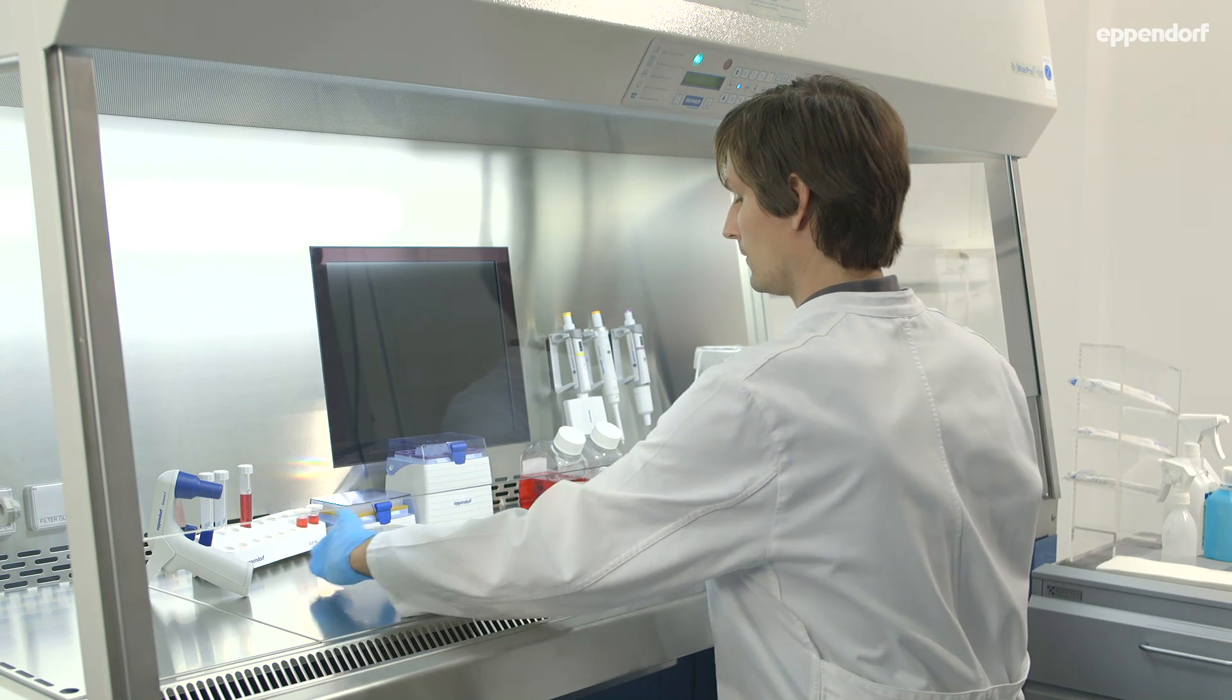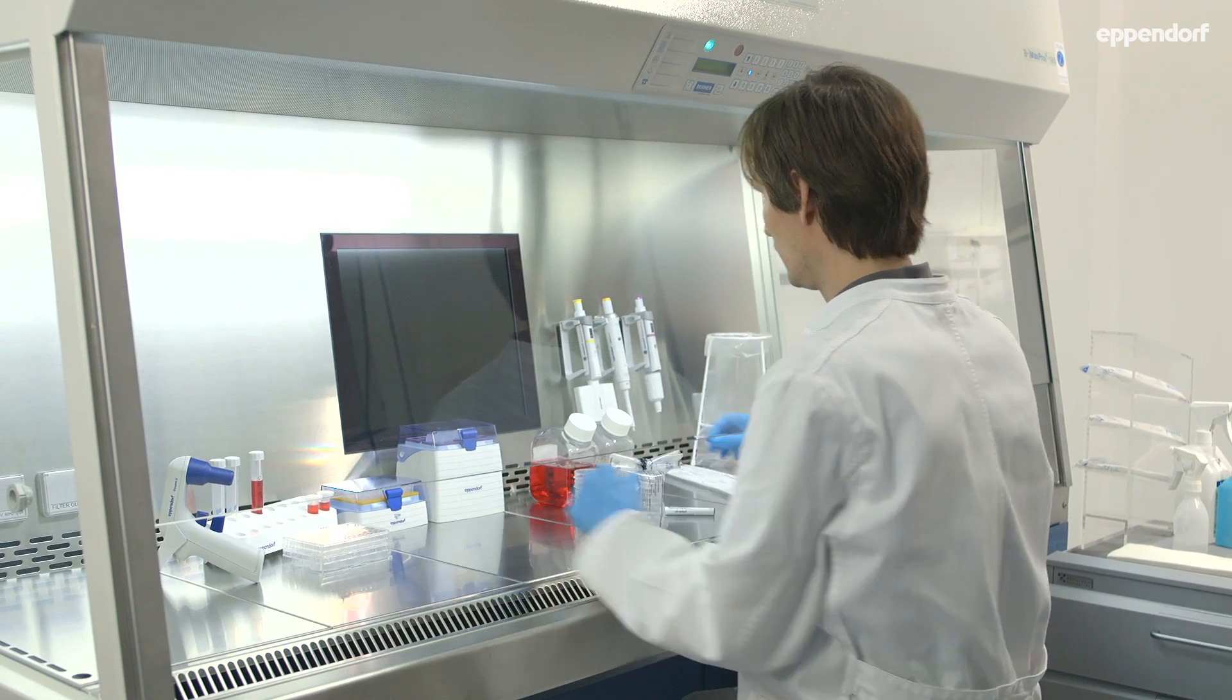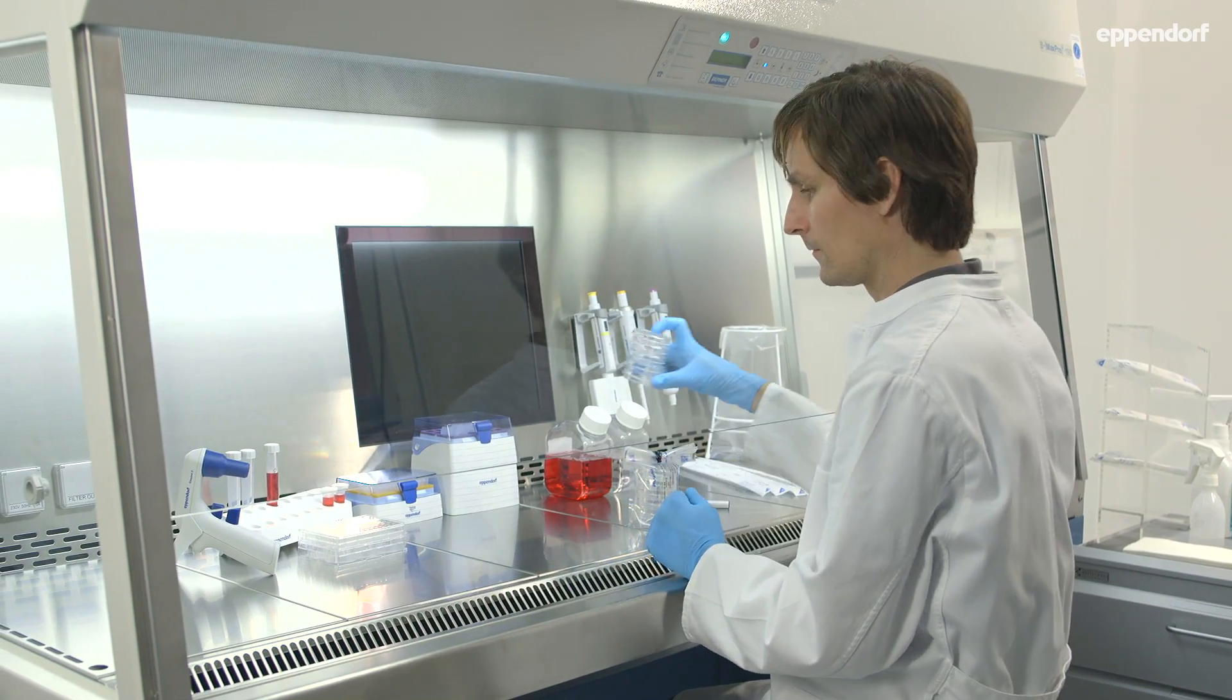Ensure easy access to all items in the cabinet and keep a clear workspace in the centre of the cabinet.